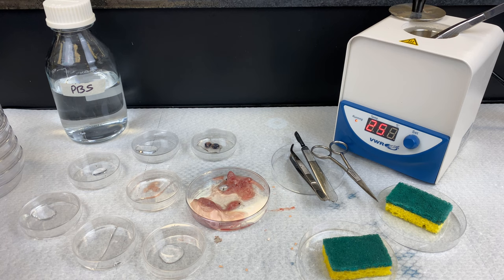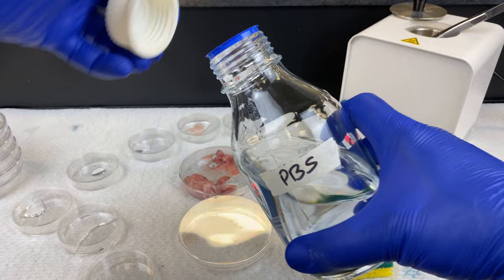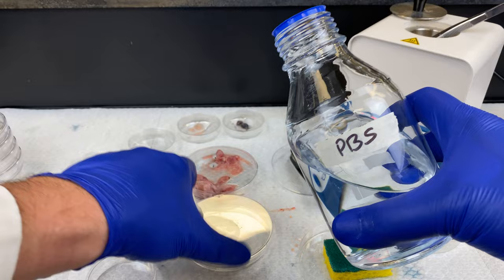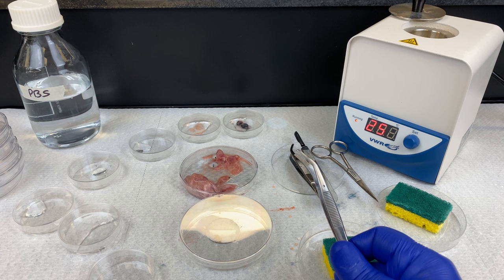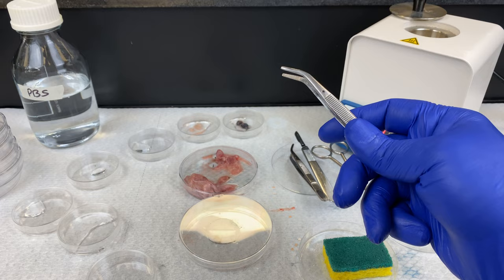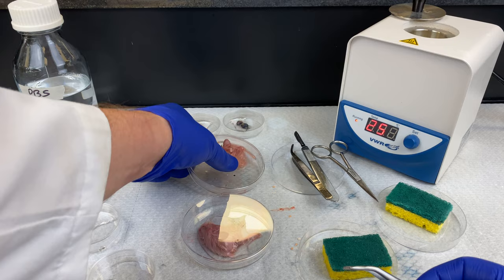Now we're going to go after the internal organs. We have to open up the body cavity to get at them. The head is pretty much done with now, so I'm going to get rid of that. I have a biohazard bag taped to the side of my bench, and any items that come in contact with the chicken must be placed into biohazard. I'm going to transfer the body of the embryo to a new dish with a little bit of PBS in the bottom so it does not stick to the plastic, then dump the old dish into my biohazard bag.